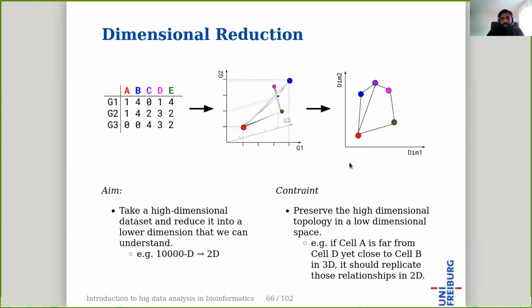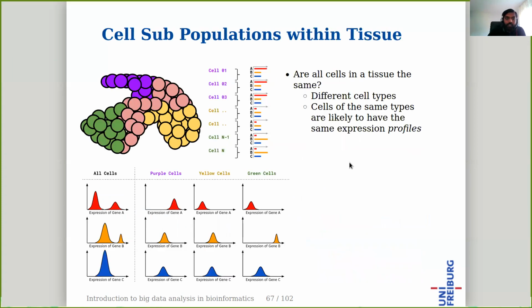Before looking at how this dimension reduction is done, you will learn more about it in the next lecture, about the PCA and so on. So we are not going into further details about this in this lecture. We will now learn more about clustering, because we've seen in the beginning that even within one single tissue, there can be differential expression. We are looking at the cells that have different expression profiles based on these gene expressions.